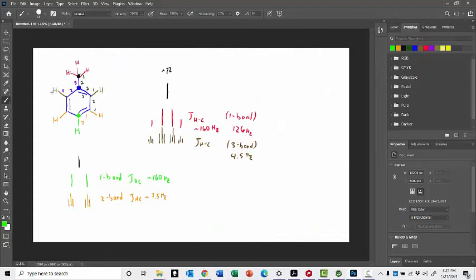And if we look at this molecule right here, what I'd expect to see is kind of surprising. Because regardless of whether I'm looking at the orange or the ugly brownish yellowish color here, I have a hard time deciding why either of them would be a nice doublet. That doesn't necessarily make sense to me, especially if the other is going to be a sextet-y sort of thing. And the easiest way for me to wrap my head around why I might end up with a sextet is to invoke these 3 hydrogens as being only 3 bonds away, 1, 2, 3, from the carbons in question. And so that gets me to a quartet right there.